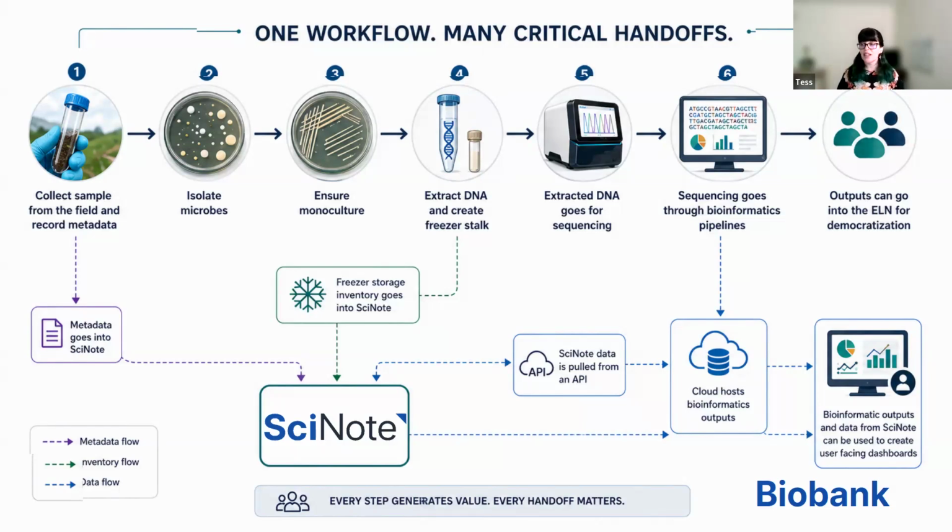Then you might extract the DNA and send it off for sequencing. So now you have a third party involved in that data handoff. You get your sequencing back, and that might go to your data team, your bioinformaticians, to be analyzed in some way.